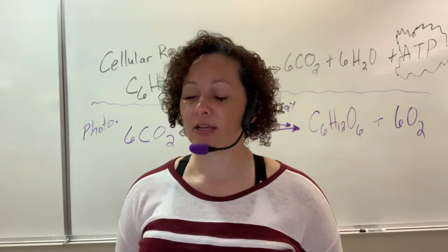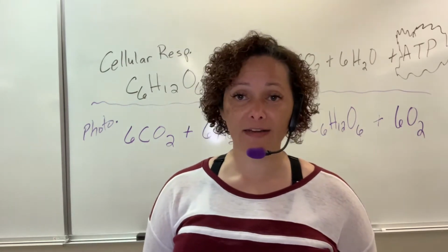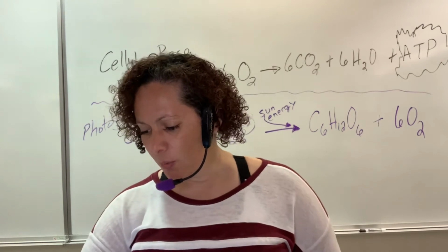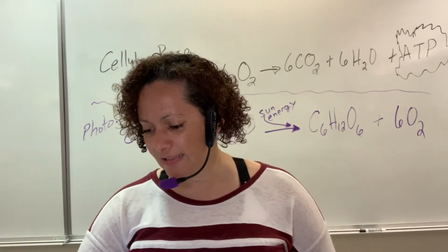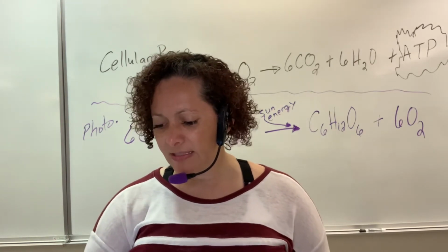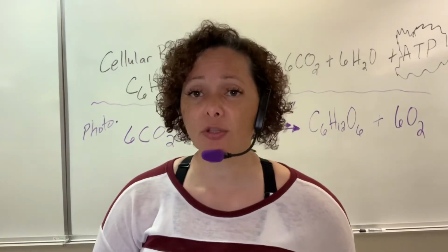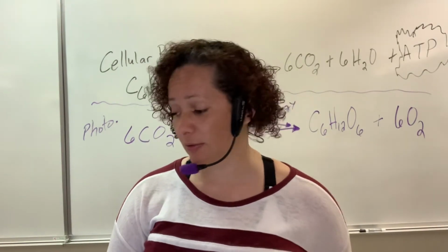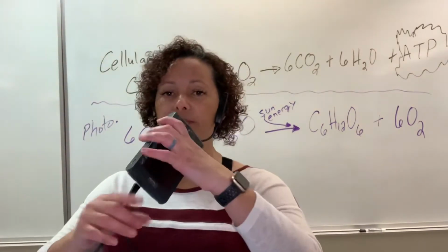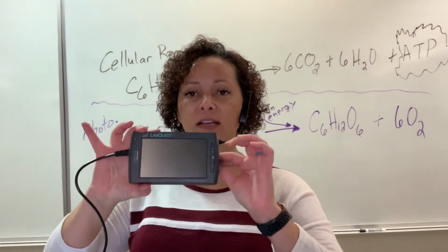We don't want poor little organisms left in the bucket where they're not going to get fed and then they end up dying. All right, so with that, to get set up, so procedure. I'm looking at the procedure part of it. To get set up, you want to set up your LabQuest equipment. The nice thing is you have already used your LabQuest equipment. So this is your Vernier. You've used this before several times.